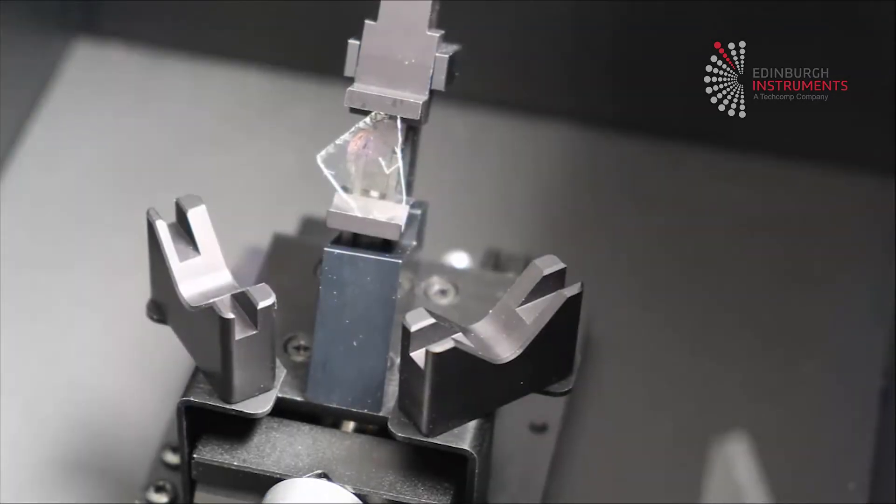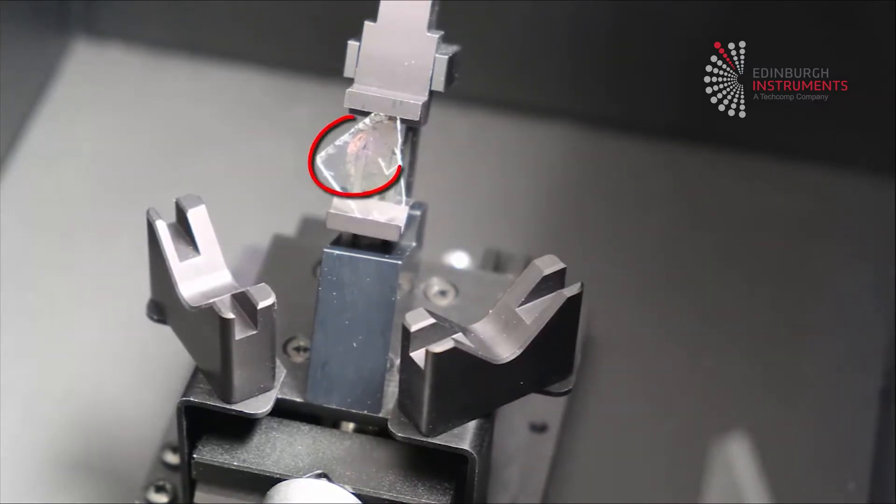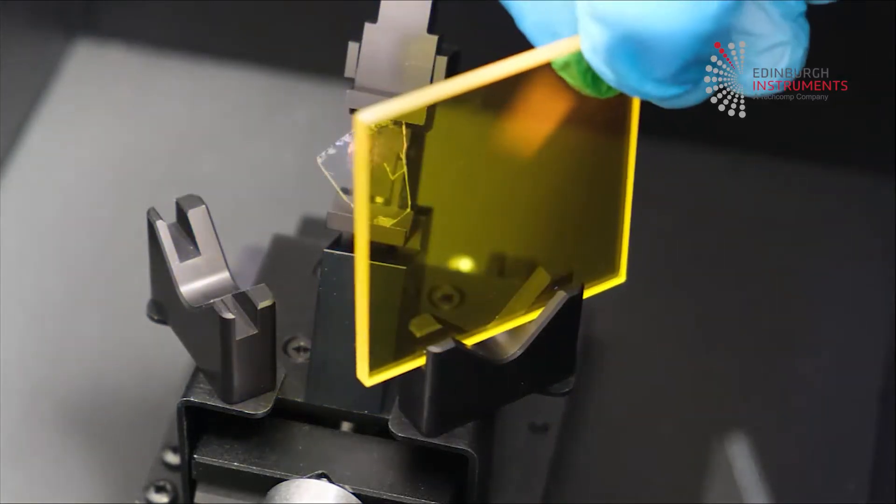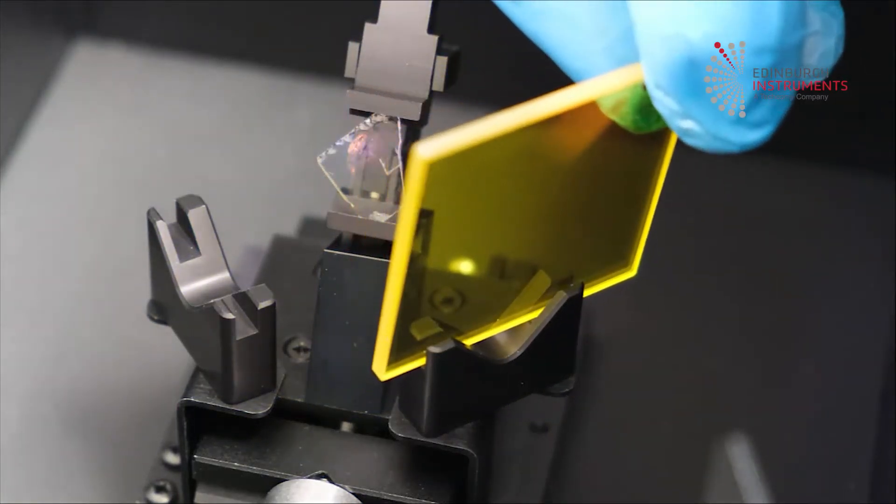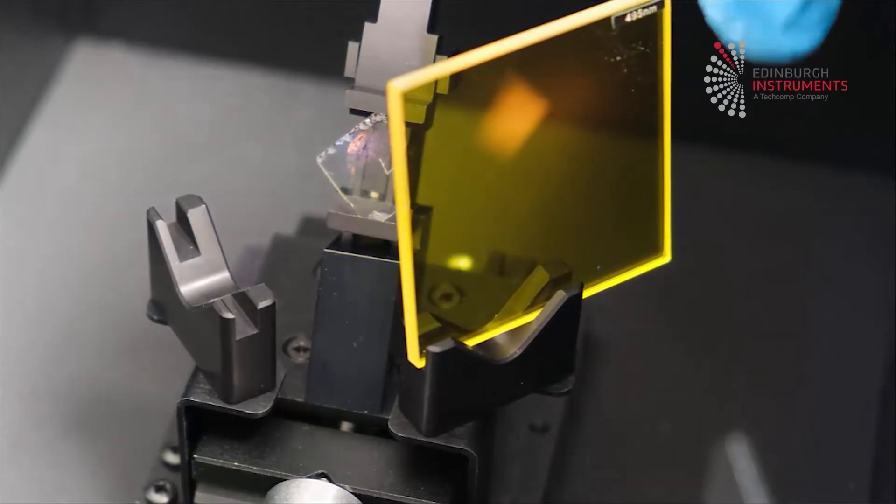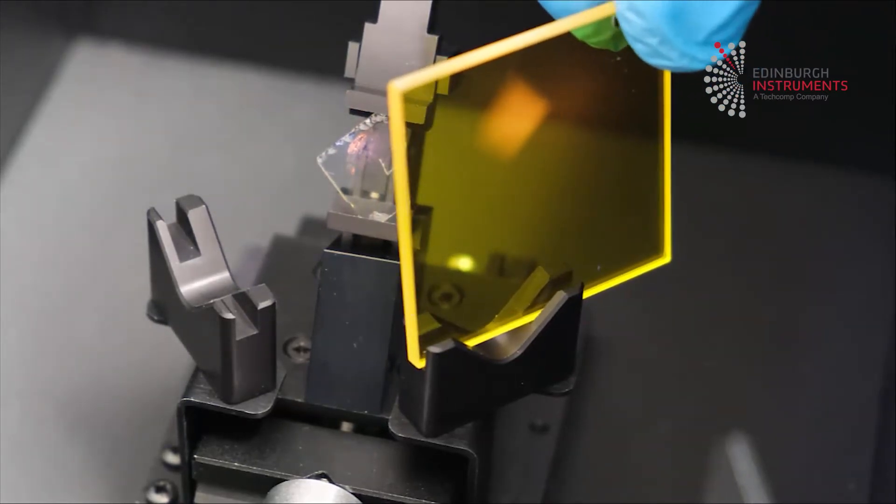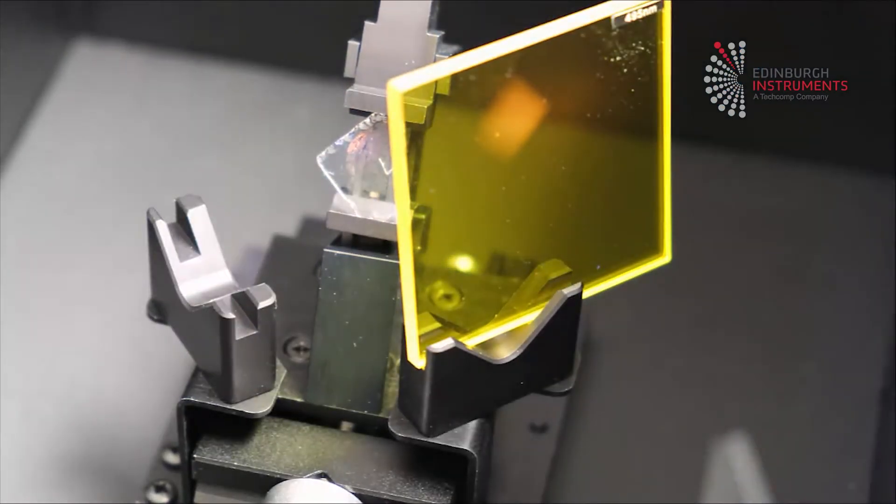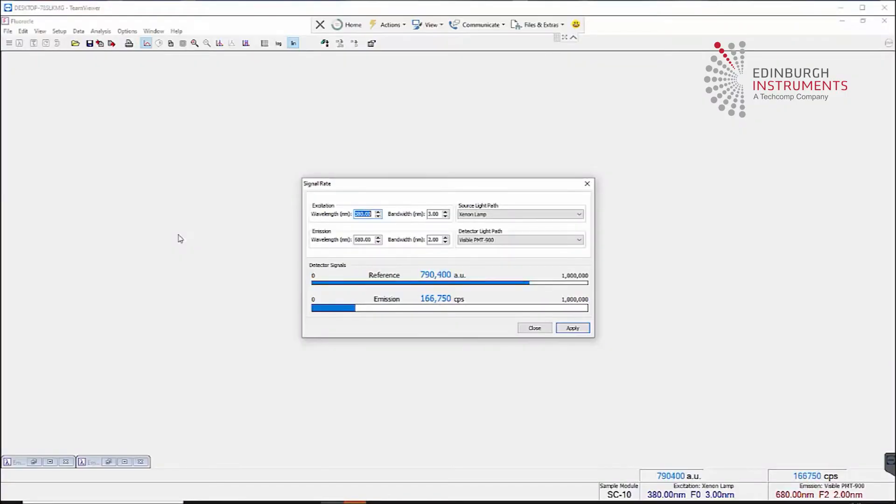We previously discussed alignment. Check that the excitation beam hits the sample by using a visible beam from the xenon lamp. For a laser source, this alignment should also be checked safely. A good tip for an unknown sample is often to excite with a high energy wavelength, say 300 nanometers, and observe the sample carefully with your eye to see if a color can be seen. This would also allow you to make a guess at the emission wavelength.